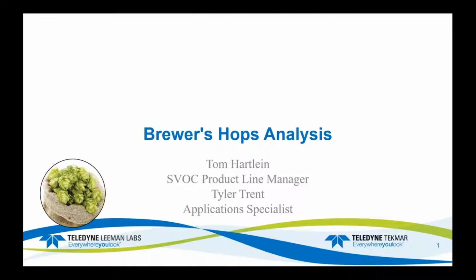Thanks, Shelley. Good morning, everyone. As Shelley mentioned, we're going to look at different analyses for hops. We'll start with terpenes by headspace, pesticides using a QuEChERS extraction, and then my colleagues will take over the metals portion for those elements. So we have a lot of material to cover, so we might as well get started.